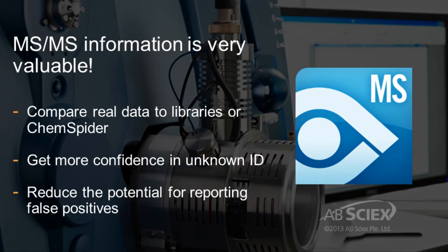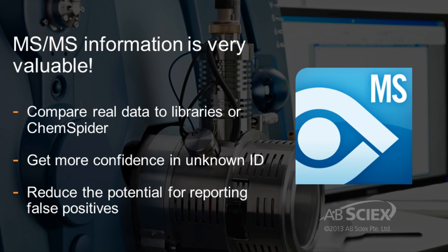The use of MS-MS fragmentation patterns with comparison to either MS-MS compound libraries, or the structures identified in ChemSpider, gives high confidence in assigning identities to detected peaks when performing a non-targeted screening analysis.